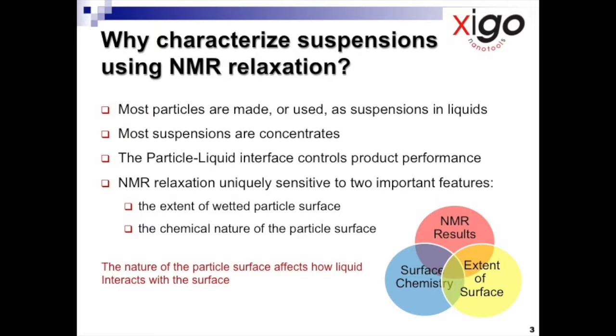So why characterize suspensions using NMR relaxation? Most particulate materials are made or used as suspensions in liquids, and the majority of suspensions are concentrates. Further, it is the particle-liquid interface, no matter what the particle, no matter what the liquid, that controls product performance. And product performance is defined as what the suspension is designed to do or be used for.